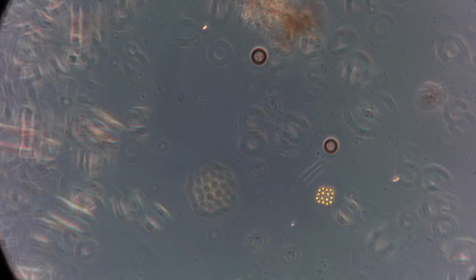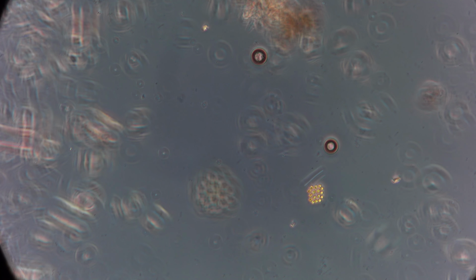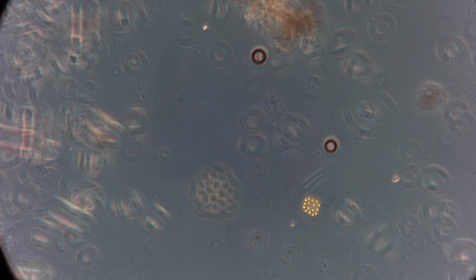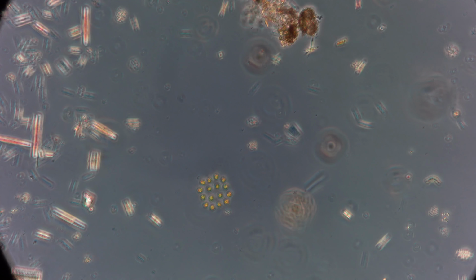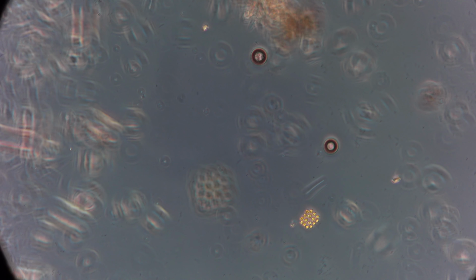Ooh, there's another one. It's just tumbling around. Yeah, little swimming colonial algae. Do they always form structures of all different shapes? Is it like different volumetric, or is it generally on a 2D plane? They can be different. It's not always 2D like this.